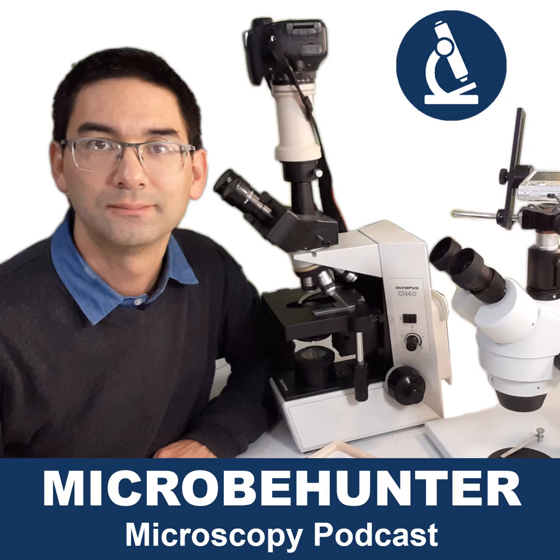So yes, I think this was a very deviating answer, sidetracking a lot, and I simply want to summarize my main points. The type of microscope that you want to get depends very much not on what you study, but on the specific research interests that you have. You cannot simply say that for microbiology you need this type of microscope, or for genetics another one, or for biotechnology a third one. It doesn't work like this, because for the specific research question, you need specifically equipped microscopes.